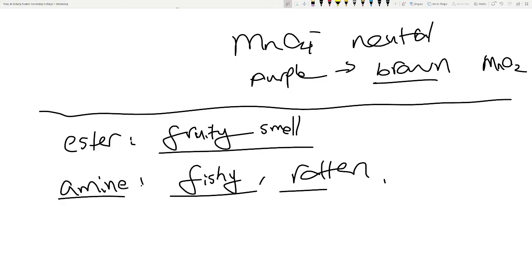But yeah, these are all the distinguishing tests. You've got your alkenes and alkynes with bromine water, carboxylic acid with litmus paper or carbonate, your aldehydes with Tollens or Benedict's solution, your primary, secondary, and tertiary alcohols with the Lucas test, your amines with litmus paper. And then you have the solubility test, and the acyl chloride with water. Normally the really difficult ones to distinguish are ester and amide, and even haloalkane, but they can be processed through the process of elimination.